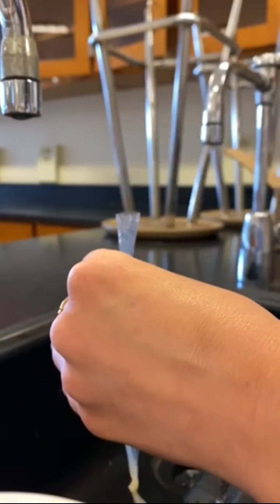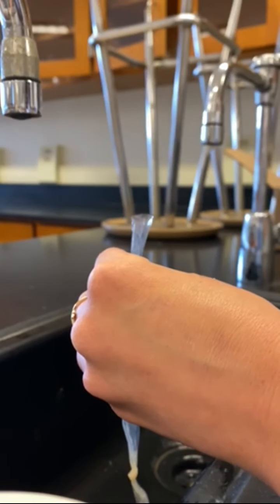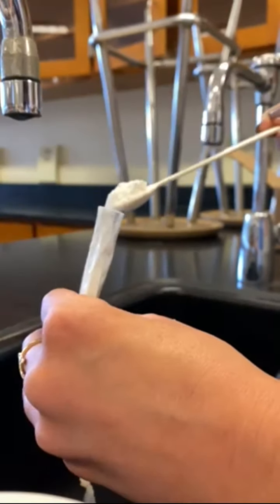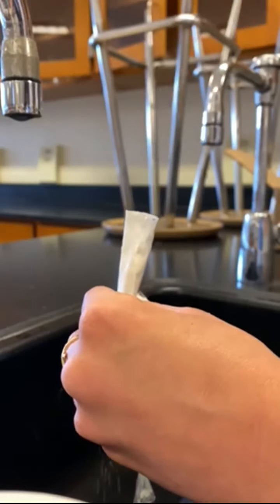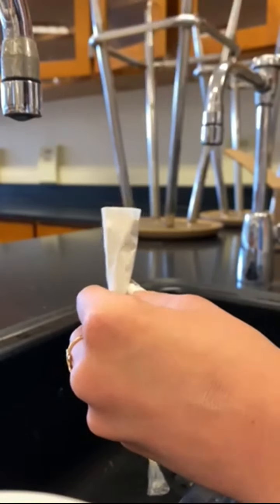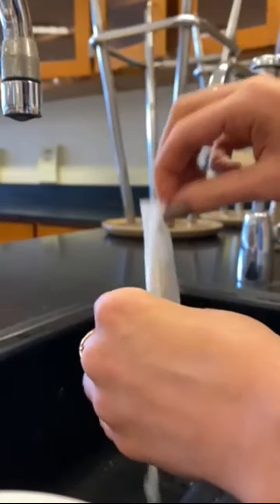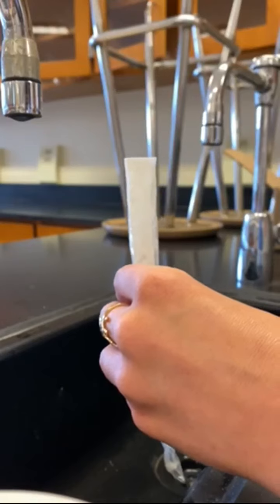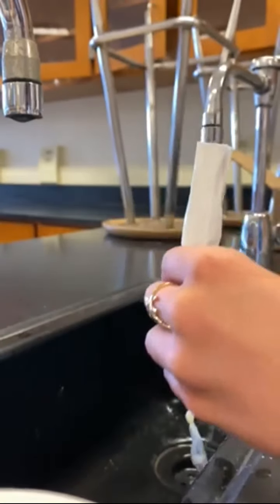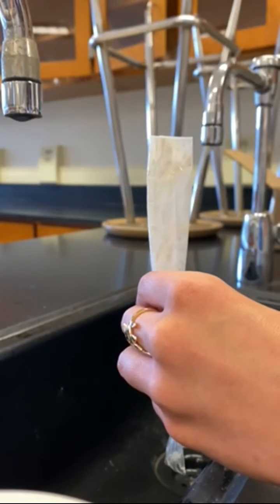This is the fun — slash messy — part where we're going to get the flour inside of our dialysis tubing. Every year it is an absolute mess when we do this, but that is totally fine because that is kind of the fun of science. I don't really care how much I get in there — as long as we get some flour in there we'll be able to see our results. Flour is an example of a very big complex carbohydrate that we're going to call a polysaccharide. It is large in terms of molecules, and that's actually the reason the iodine turns that purple-black color when it contacts this complex carbohydrate. If you put iodine on regular sugar, it would not change color.